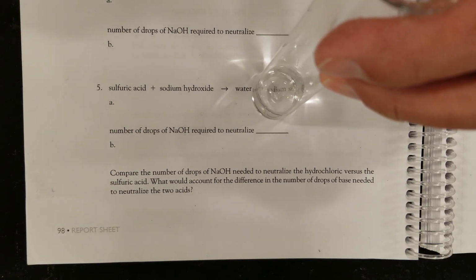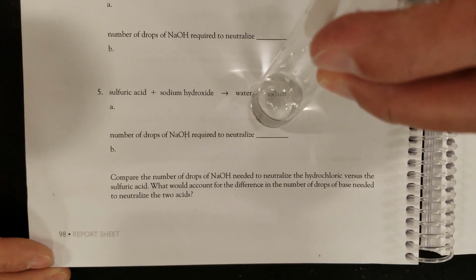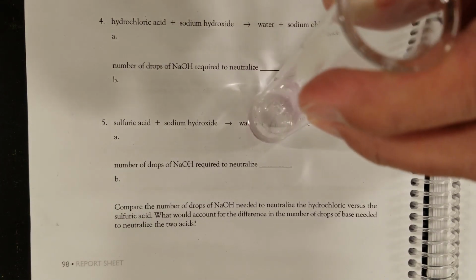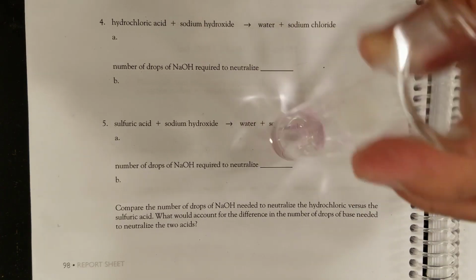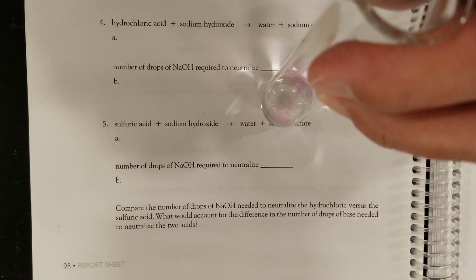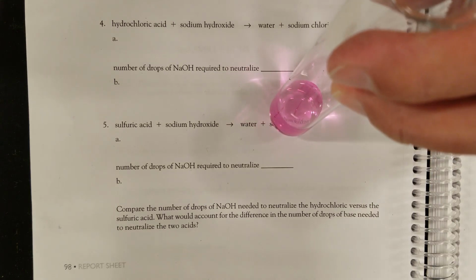Now, the hydrochloric acid turned pink after 5 drops. We've already added 5 drops to the sulfuric and it still hasn't turned pink. 6 drops. 7 drops. 8 drops. 9. 10.